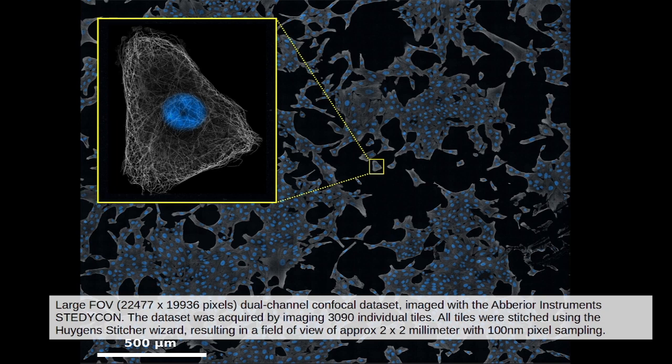But if you also want to store the experimentally distilled point spread function in 32-bit floating point decimal numbers, together with the deconvolved and fused images in 32-bit decimal numbers for further analysis, then the resulting images will become more than 4 times larger than the original ones. For this purpose, file compression can be very useful.